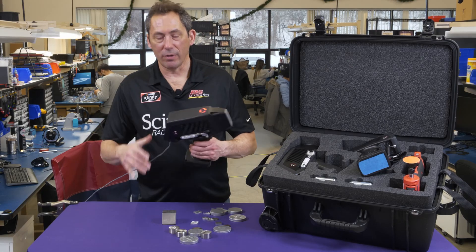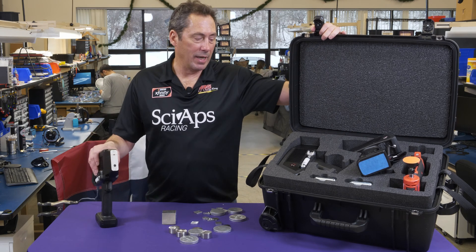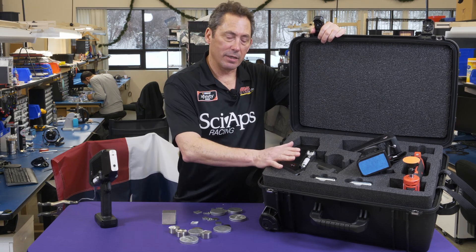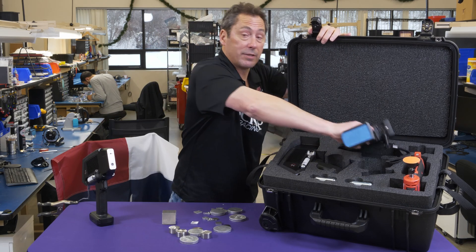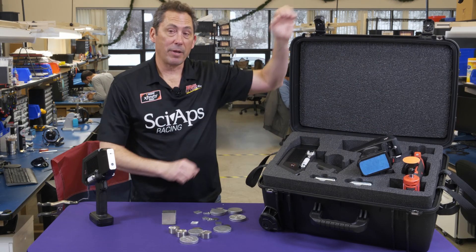Here we are back at SciAps for another video. Today we are talking about what we call the one box. What we've done is packaged a handheld LIBS device like this one, along with our XRF device, and we sell that as a package.